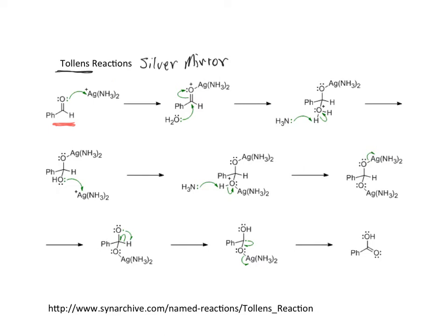So we will start with silver nitrate, which, being a nitrate, if you go back to your solubility table from general chemistry, nitrates, when we put them in water, are soluble, and we would get the silver ion plus the nitrate ion, aqueous.